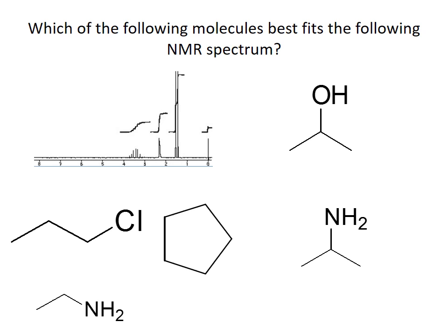Which molecule best fits this spectrum? Well, again, someone integrated the TMS, which you don't do. Let's look at the rest of the spectrum. If I look at this, first of all, notice this peak. It's kind of broad. What does that indicate? Well, that indicates to me a protic compound. So I'm going to say it's going to be one of these.